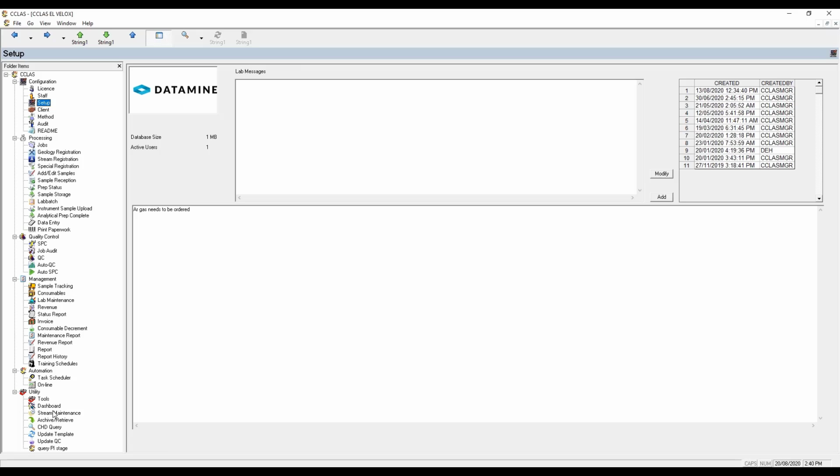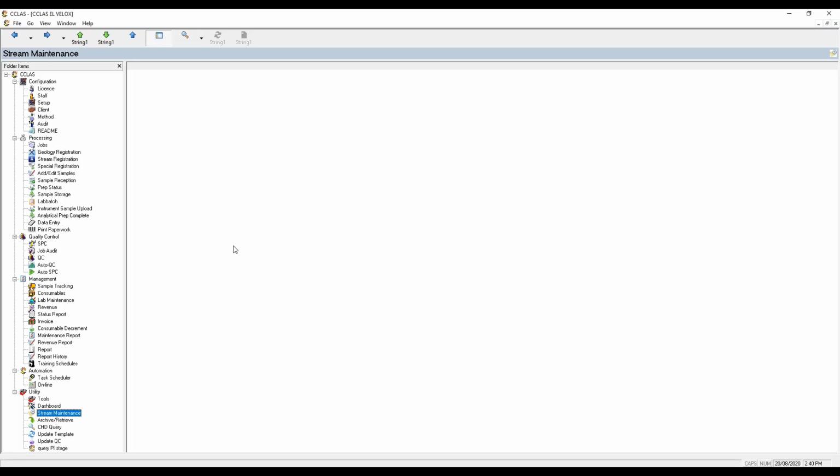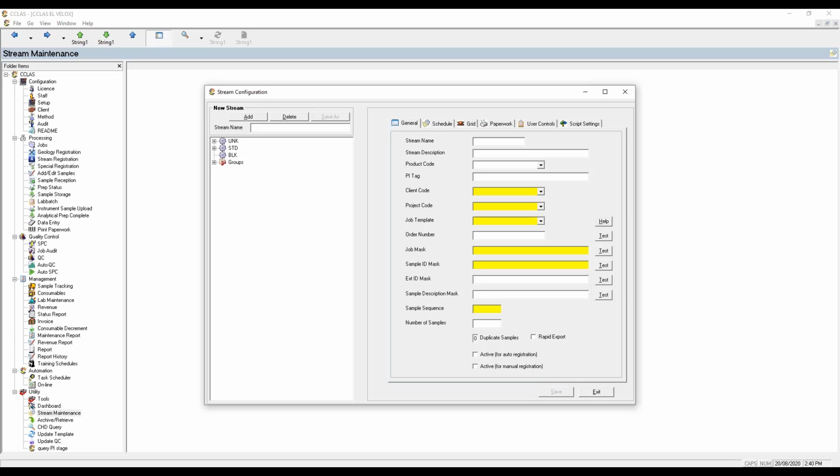So without further ado, I'm going to open up the stream maintenance. And while I'm opening up, I'll just explain that we haven't at this point done any presentations on the stream configuration, but we are planning a series of videos about more fundamental aspects of CCLAS. And this, even though it is Velox, we consider to be one of those fundamental aspects. So there will be a presentation or a recording made which details the use of this particular application.